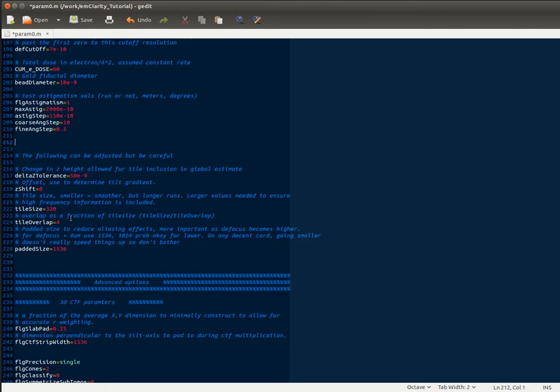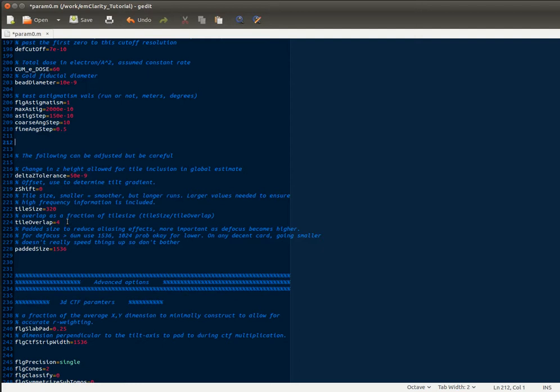I would leave the padded size and tile size and overlap pretty much alone. But the tile size—you need a minimum size to be able to get enough signal and also to include the high frequency information. Overlap just results in a lower noise in the final periodogram average. And the padded size is important to avoid aliasing. You want to make this pretty big. And for the GPUs we're using, making it smaller than 1024 doesn't really make a big difference.